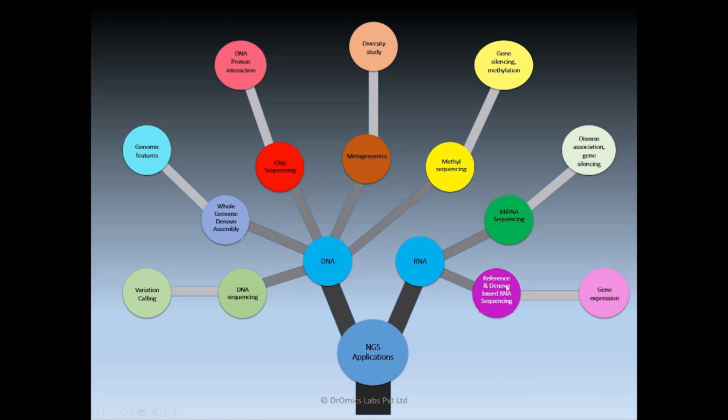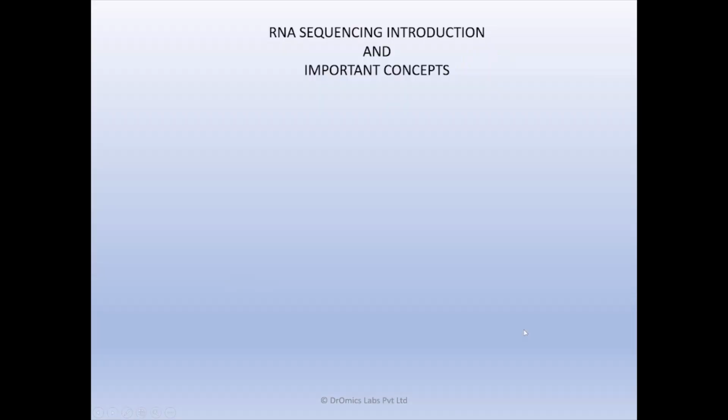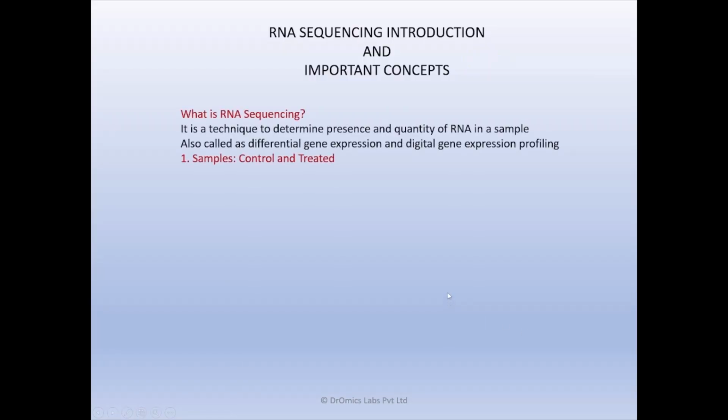In detail, we will talk about reference-based RNA sequencing. So what is RNA sequencing? It is nothing but the technique to determine the presence and quantity of RNA in a sample. This technique is also known as differential gene expression profiling, or digital gene expression profiling.